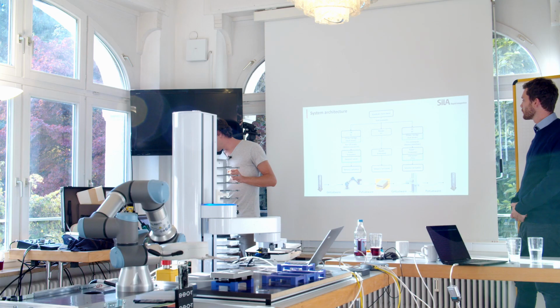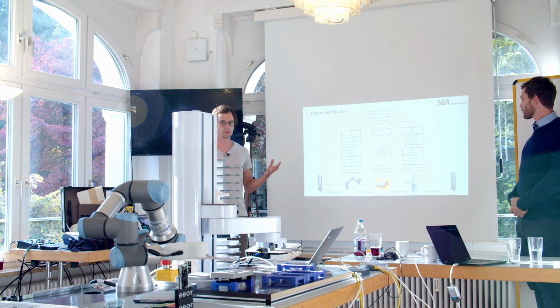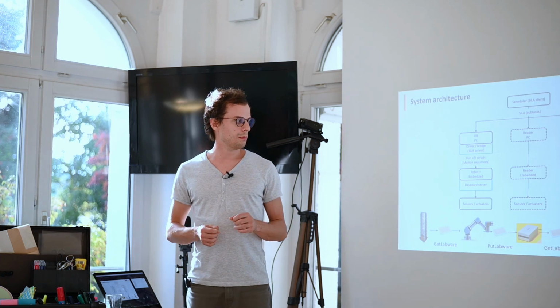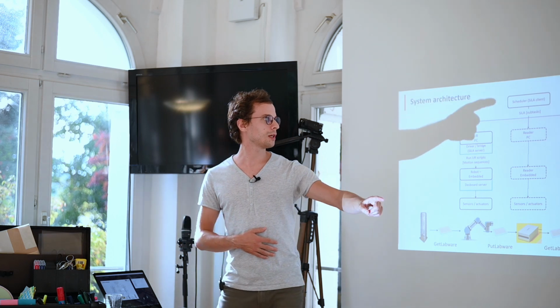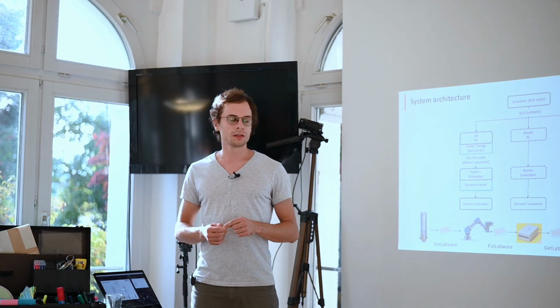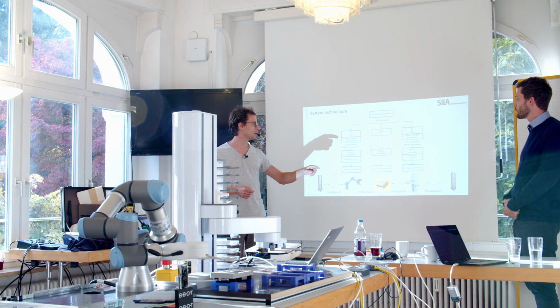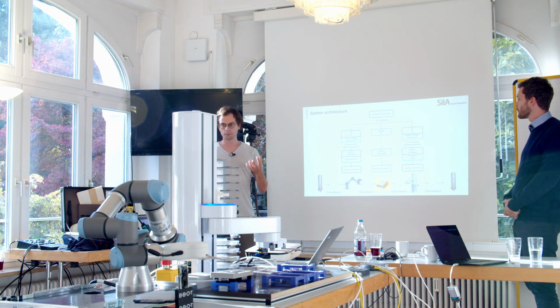So here is the system architecture. This reflects the levels of the system on the hardware side. So you see we have the scheduler that acts as a SiLA client, and it communicates with each of the robots and the dummy device through SiLA, and implements the tasks and subtasks.